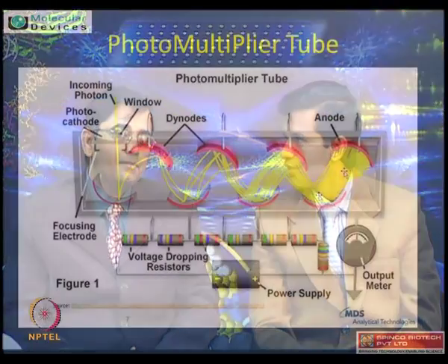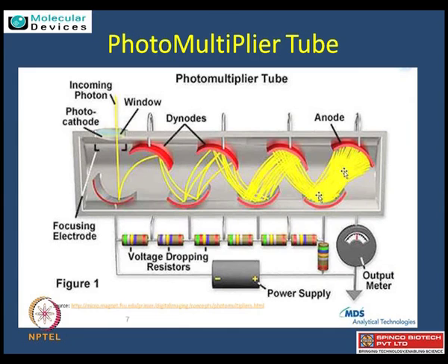Yes, essentially because they are all not present equally, the data could range from zero intensity, which will be equivalent to the background, to the very highest intensity. The best way to control the variations is looking at a photomultiplier tube. That is nothing but, once you do a fluorescence, the intensity coming out of that. The very low expressing genes or proteins will give you very low fluorescence intensity, whereas the high will give very high.